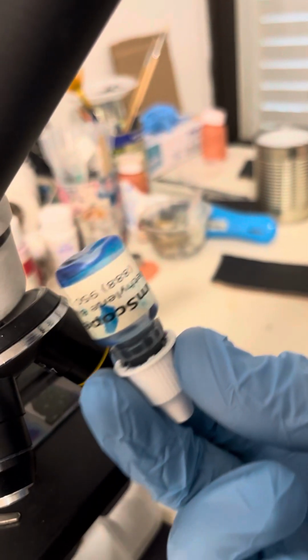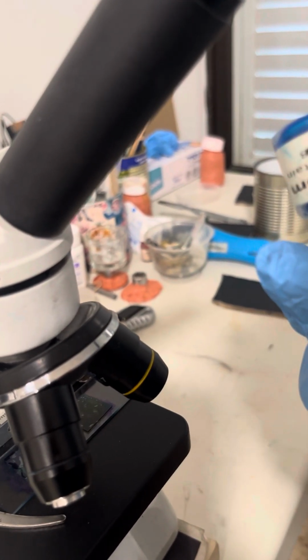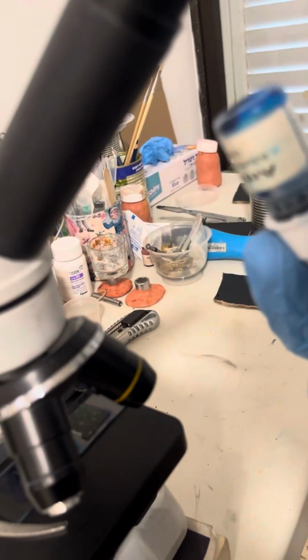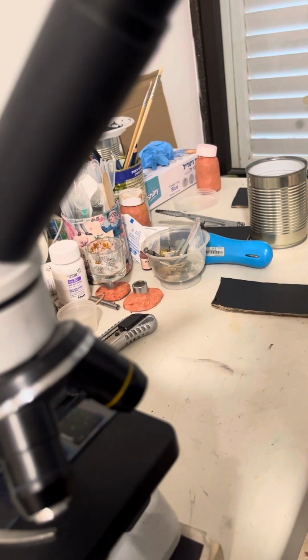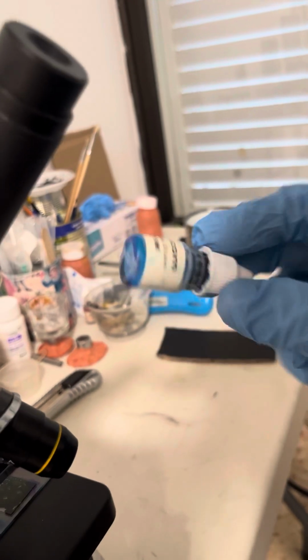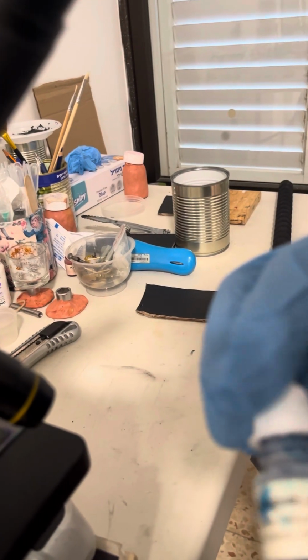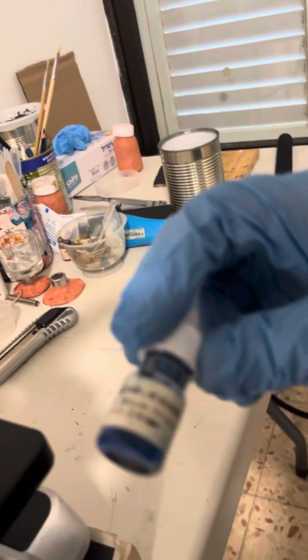I'm almost out of methylene blue, which is not good because this is actually not that easy to purchase. I bought it online with my mother's credit card more than a year ago. So if she allows me to do it again, maybe I'll buy something like that again from Amazon or another international retailer, because in Israel you cannot find it. I couldn't find it even in laboratory stores. It's not easy to find methylene blue.